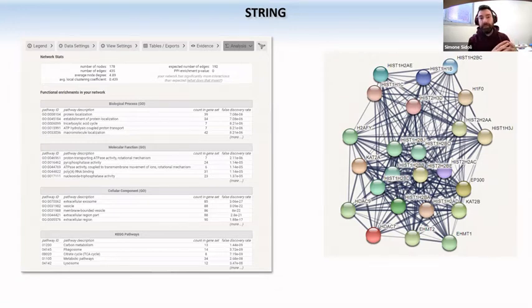I would maybe find it more interesting to start from that cluster rather than starting from a single protein that seems to be involved in another function, but doesn't have any other proteins related to it that are co-regulated. Of course, it's an arbitrary decision, but consider that it's very, very rare that in a cell, proteins act alone. So identifying protein complexes or protein clusters could be very helpful to gain confidence that this is really happening in my proteomic experiment.